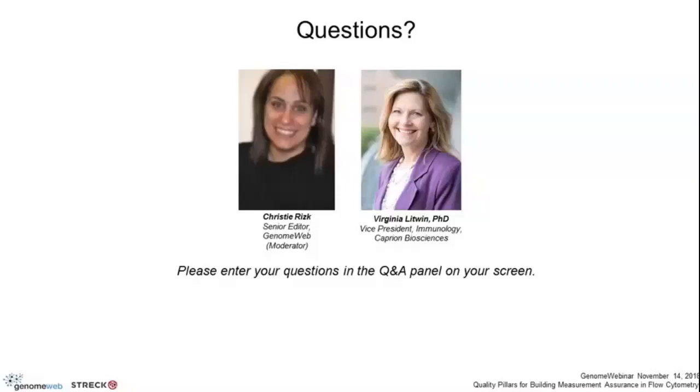Well, okay, that's a great question. So with the control material, okay, long question. We don't have standards, right? We don't have a reference material that's going to have, okay, my assay has 23 reportable results. No, you won't get target values for all those in your reference material.